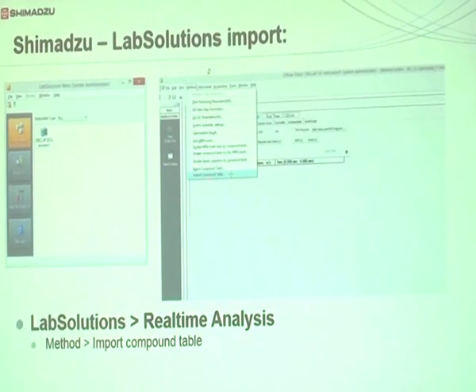After that you will specify what should be the time program, the HPLC time program, and whether you want to do staggering. That staggering you can specify, and what column you want to use, you can specify that. After all these parameters are optimized, you can give a run and perform the analysis. After the analysis is over, you can import that result or data file in the Skyline software again, and you will be seeing here different colored symbols.